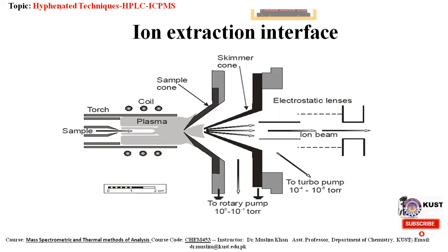For this reason, it is absolutely critical that the secondary discharge is eliminated by grounding the RF coil. A number of different approaches have been used in previous years to achieve this, including a ground strip between the coil and the interface, balancing the oscillator inside the RF generator's circuitry, a grounded shield or plate between the coil and the plasma torch, or the use of double interlaced coils where the RF fields go in opposite directions. They all work differently, but basically achieve a similar result, which is to reduce or eliminate the secondary discharge.